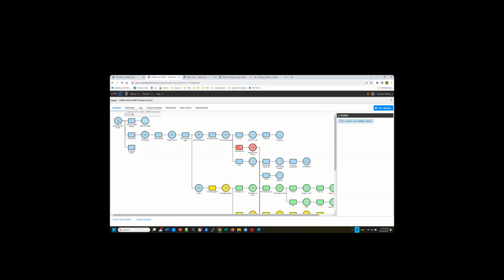It's not like gene expression, where you always have around 30,000 genes. This can vary a lot, and the peaks can be numerous. We have 134,000 features. Actually, only 30,000 features are genes. The rest, hundreds of thousands of features, are ATAC. Okay. And now you can do what we learned before, pre-alignment QA/QC.